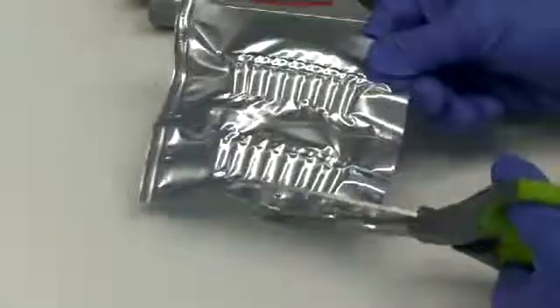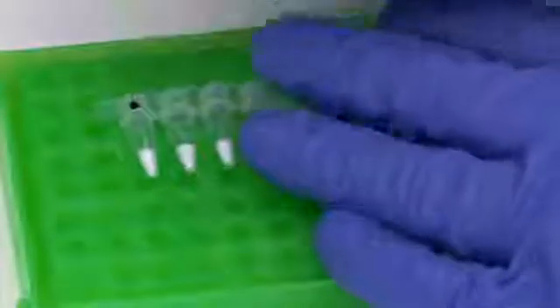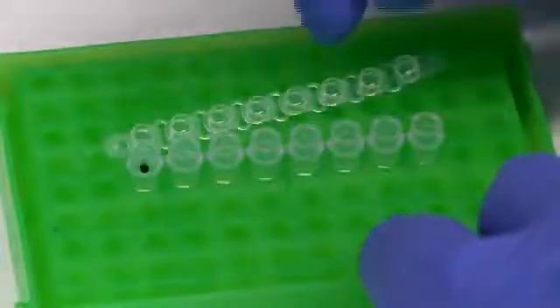Take the sealed foil reaction pouch and open a strip with your scissors. Take out your strip of TwistAmp XO reactions and mark one end using the permanent marker pen so that you can orientate the strip. Place the strip of tubes in a suitable rack, remove the lids, and place the lids inverted next to the strip.